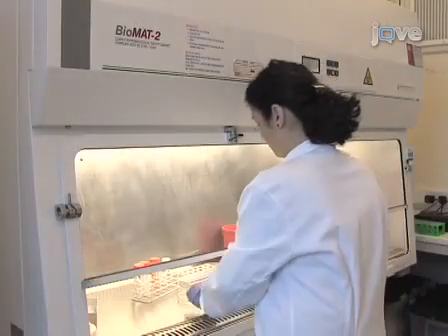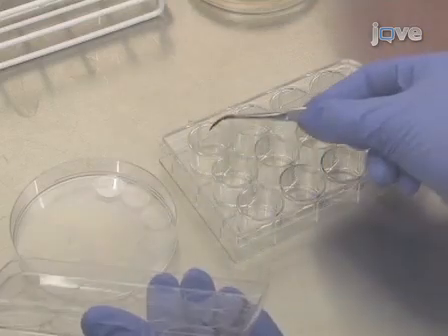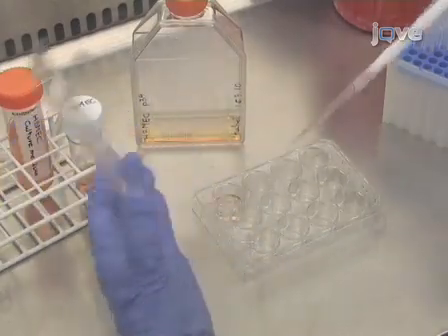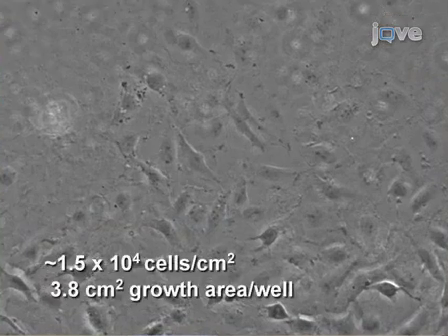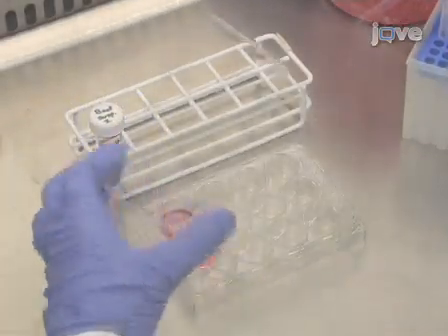Human brain microvascular endothelial cells, or HBMEC, are seeded 2 days prior to immunostaining. Place 16 millimeter glass cover slips into the wells of a 12-well plate and seed HBMECs at 50% confluence on the cover slips. Incubate overnight at 37 degrees Celsius in 5% carbon dioxide atmosphere. On the following day, infect cells with the freshly prepared bacterial suspension.